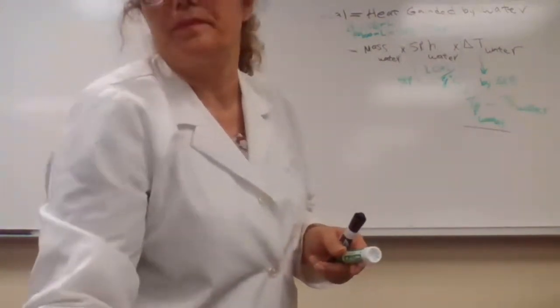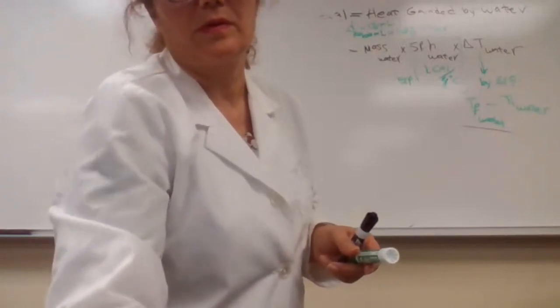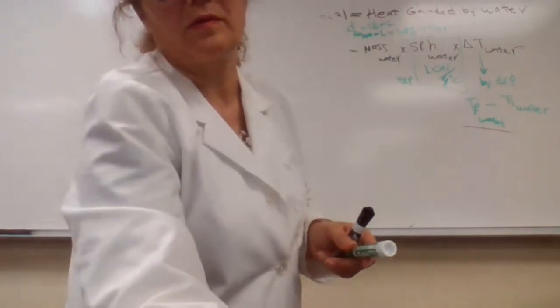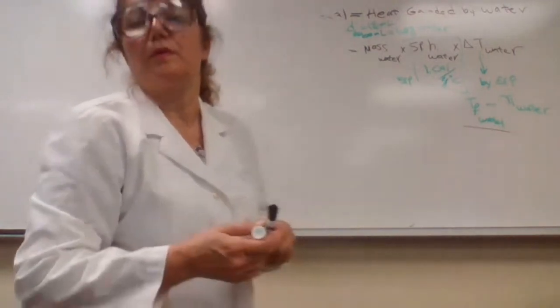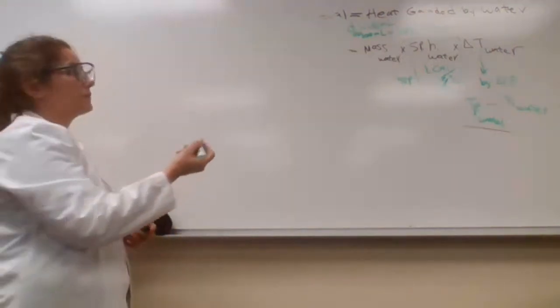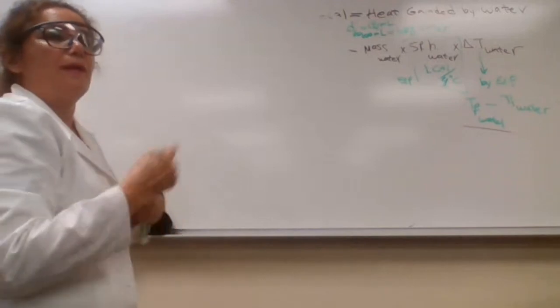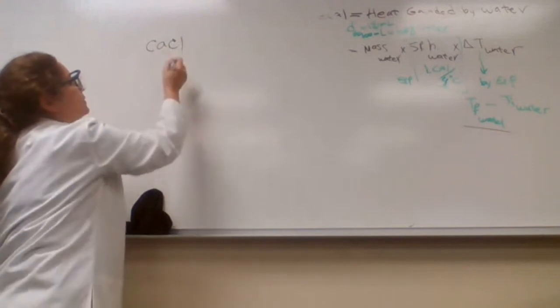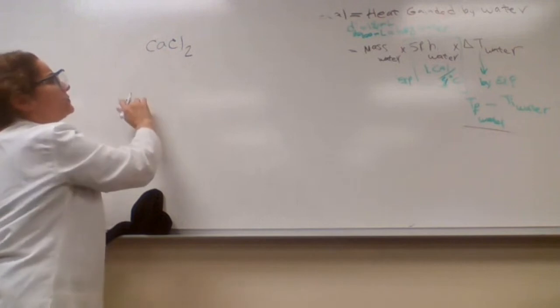You have the molecular formula for calcium chloride.